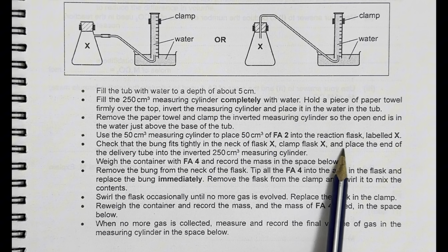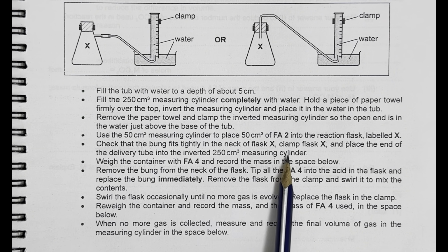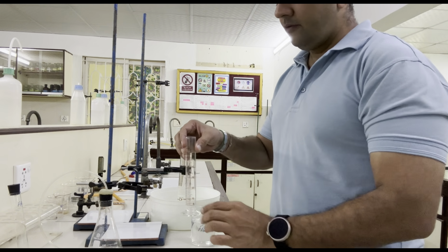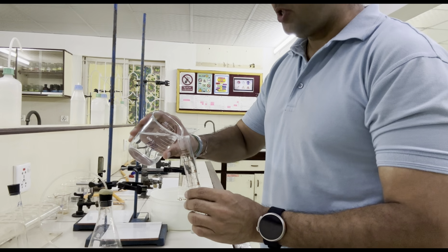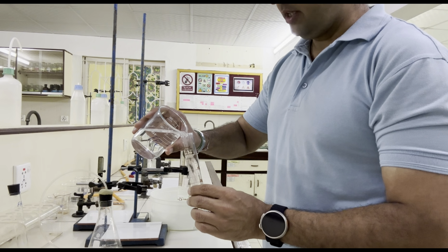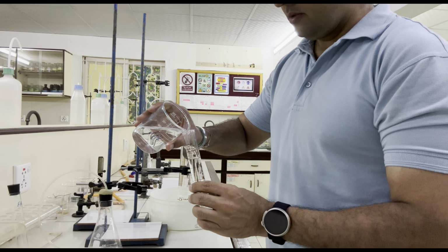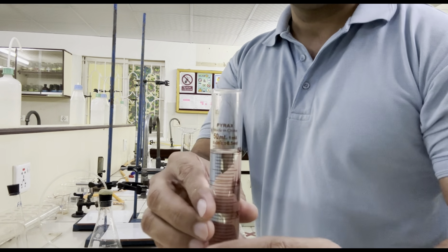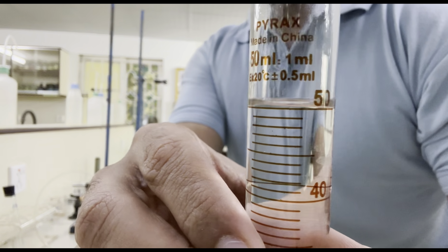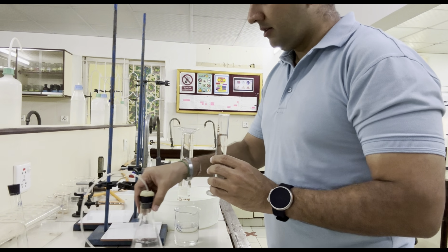Clamp the flask and place the end of the delivery tube into the inverted 250 cm³ measuring cylinder. So let's do it now. Now let me take 50 cm³ of Fa2 using this 50 cm³ measuring cylinder into the conical flask. So this is my 50 cm³ of Fa2 and I will take this in the conical flask.